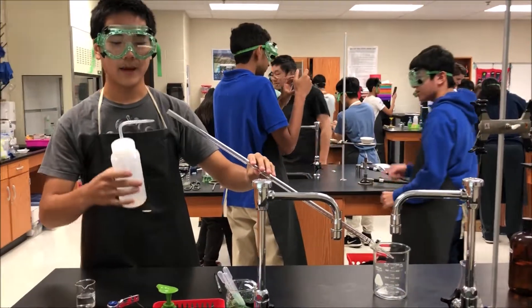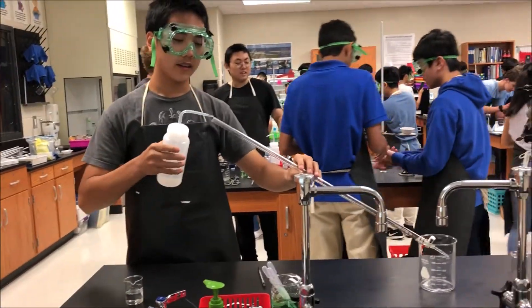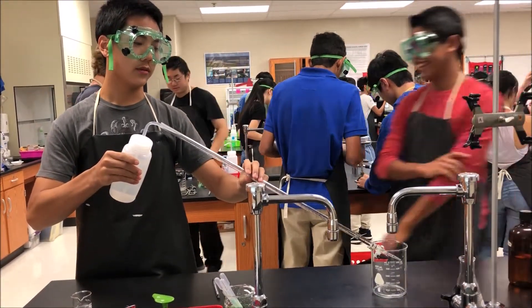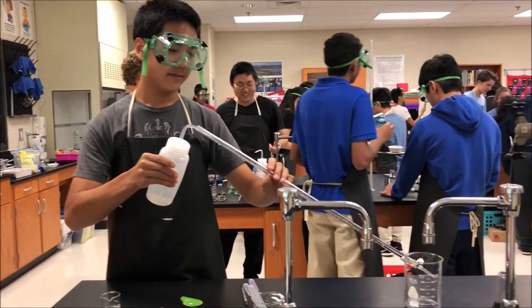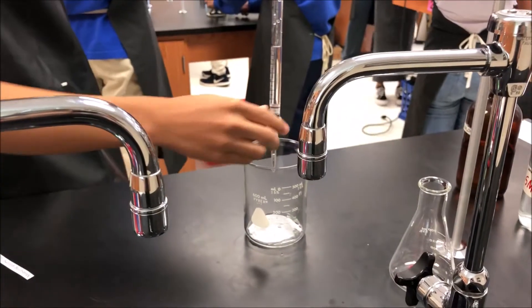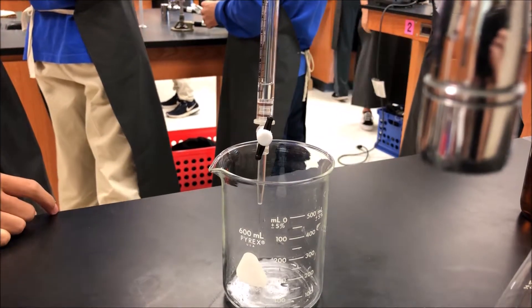Hey guys, I'm Eric. I'm going to show you how to clean the burette before you start your titration. First you're going to get distilled water, and then you're going to pour some distilled water while tilting and rolling the burette. And then every time you rinse, just let the water out as such. We're going to pour the water into the waste beaker.